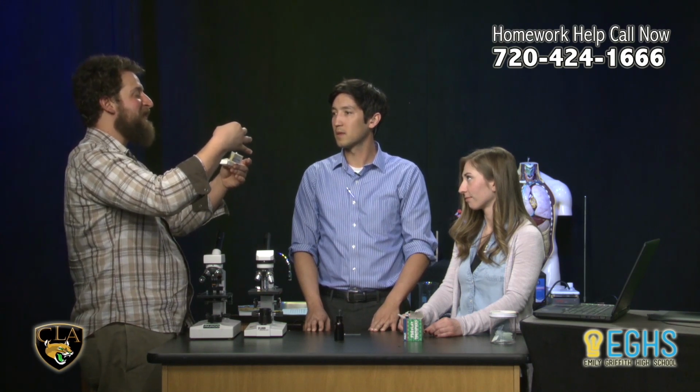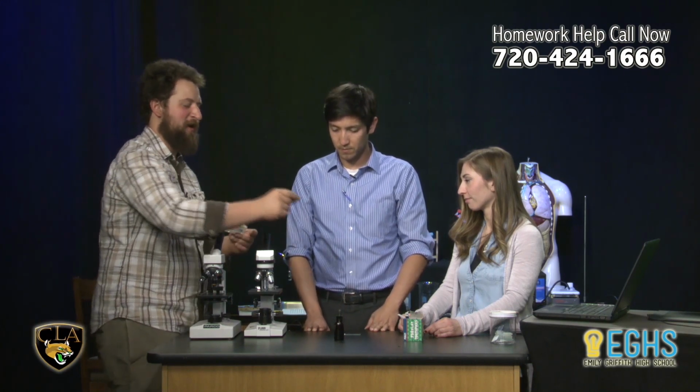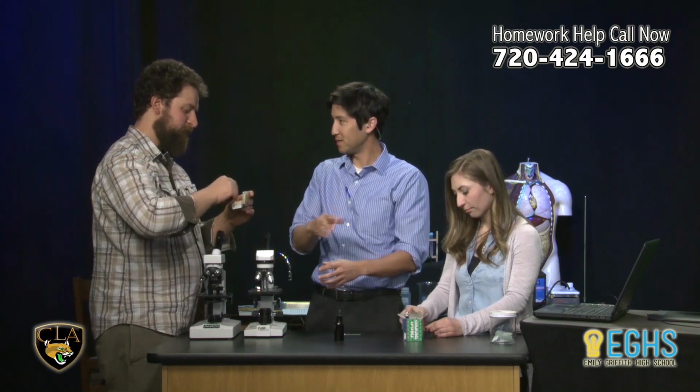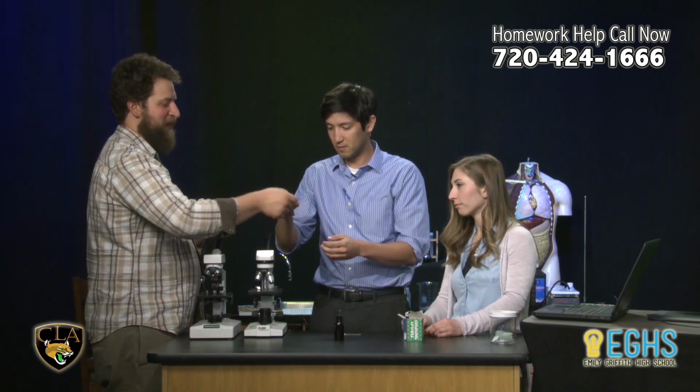If there's cells that are kind of rolled on themselves, parts of them will appear out of focus. Okay. So this will help us a little bit to flatten them into a 2D plane. So go ahead and take that. Oh, is that because of the precision of the lenses? Yeah, exactly. Just because of the focus.